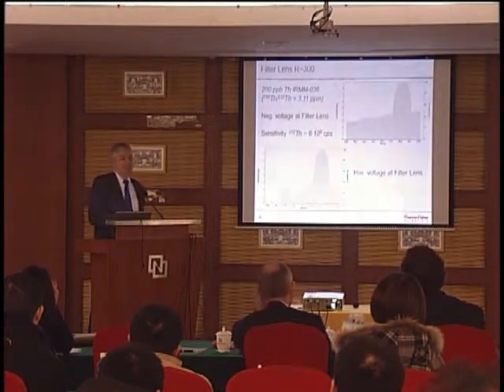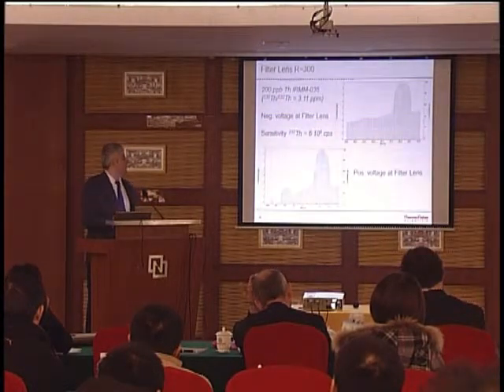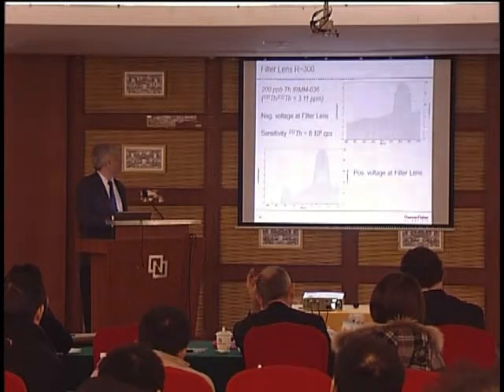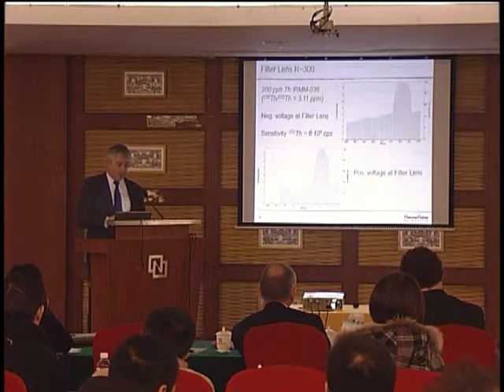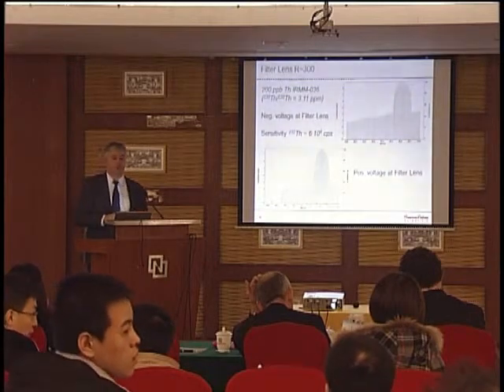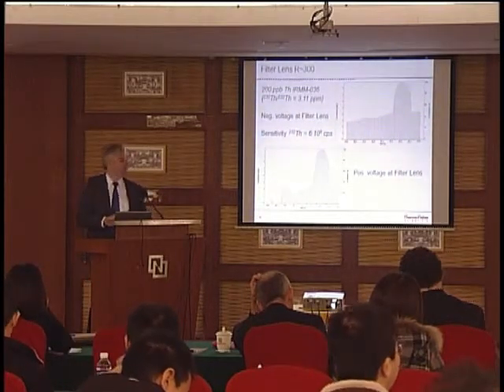So applying the filter lens in low resolution, which is on the element resolution 300, we used 200 ppb of thorium from a standard IRMM 036, where the isotope ratio 230 to 232 is 3.11 ppm.